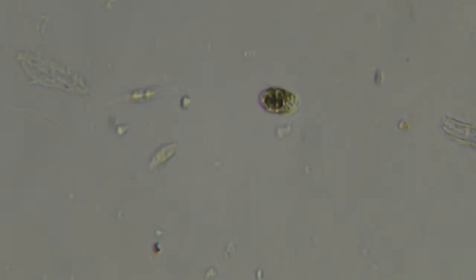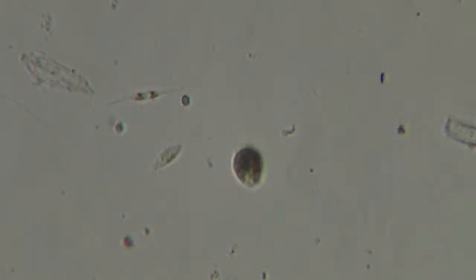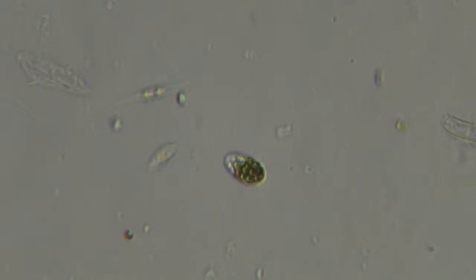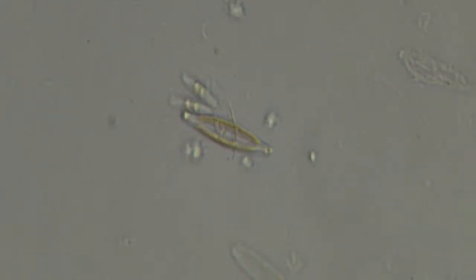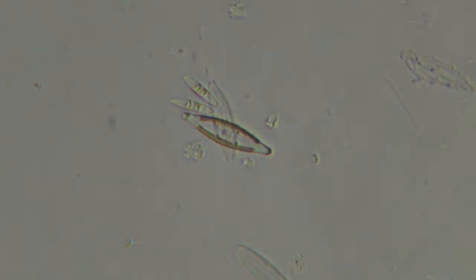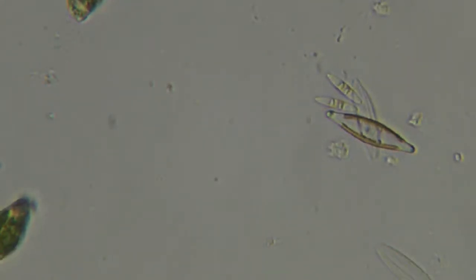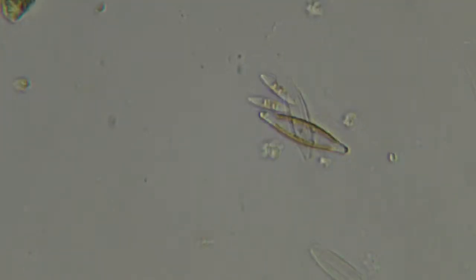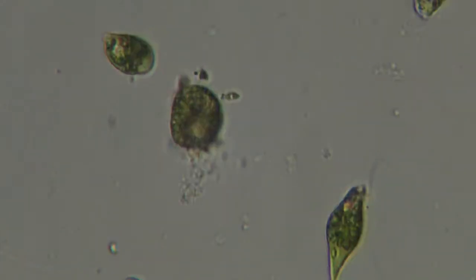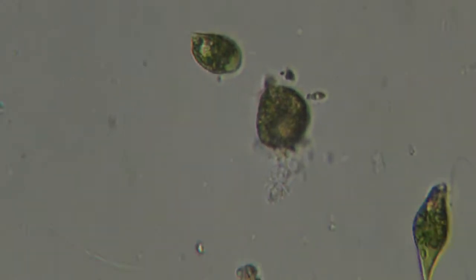Oh, look at this little guy down here. That looks like a chlorella. Nice green color, flagellated. So, single cell plant. There's a diatom right there, almost like a little mini navicula. Actually, a few of them there. Looks like little battleships parked. Contrast better there. And some guy going in a circle.